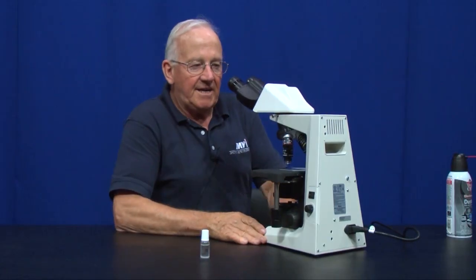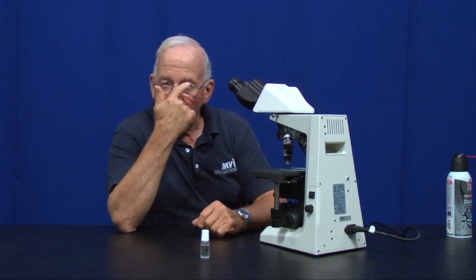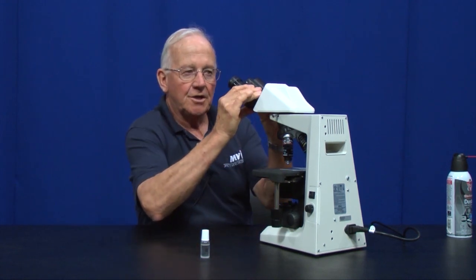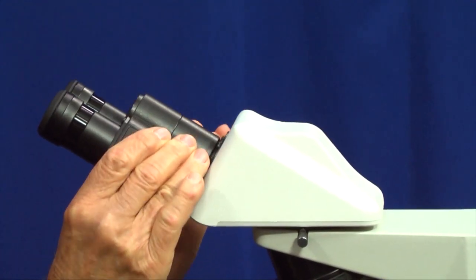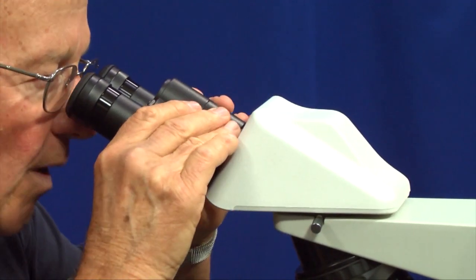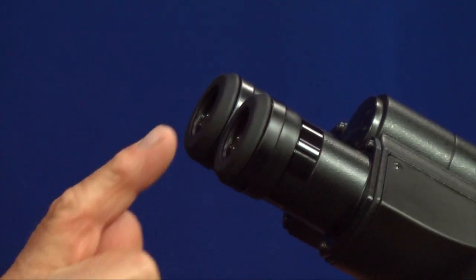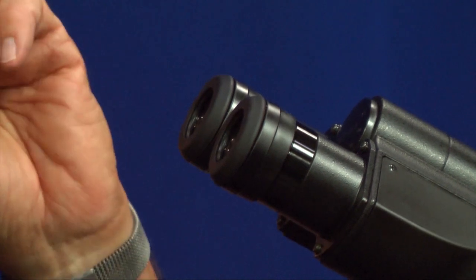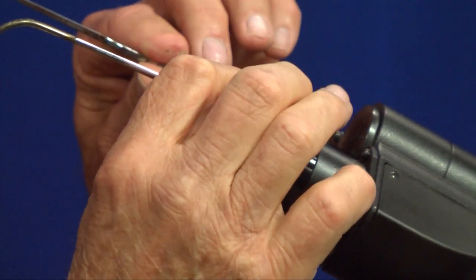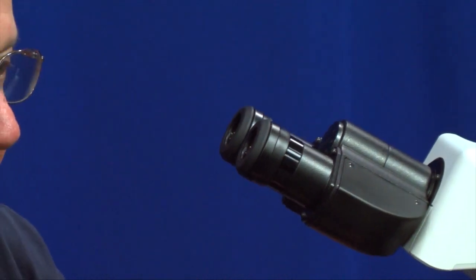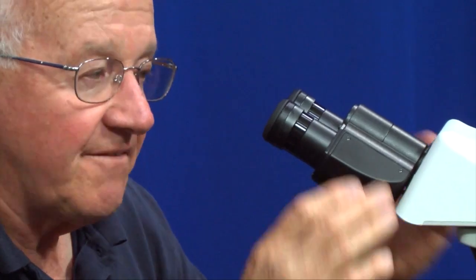To adjust your interpupillary distance on the binocular body, how far apart your pupils are, you simply grab each half of the binocular body and rotate it like so until it's very comfortable that you see one image of the specimen. One nice thing about these eyepieces is that they're called high eye point eyepieces. They make the image formed about a half an inch out of the eyepiece, and that means you can accommodate spectacle wearers, eyeglass wearers. I can wear my glasses very nicely, and we have coated the top of the eyepiece with a rubberized material so you won't scratch your glasses. That's a very nice feature.